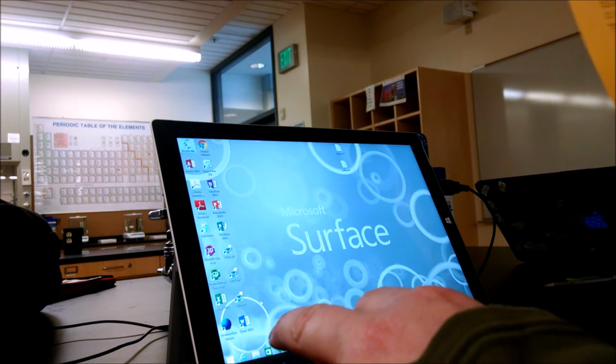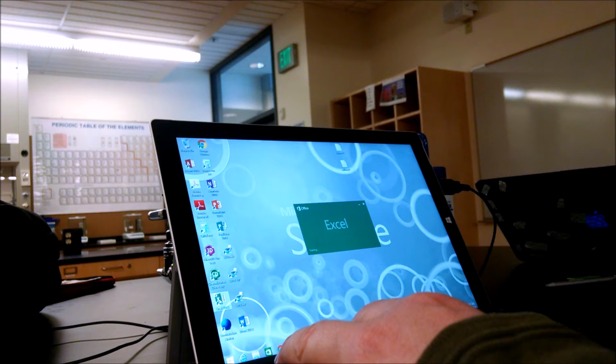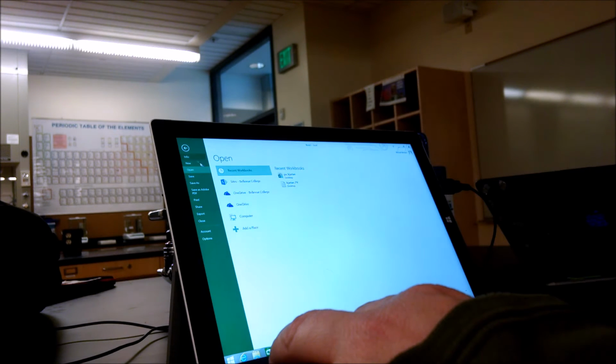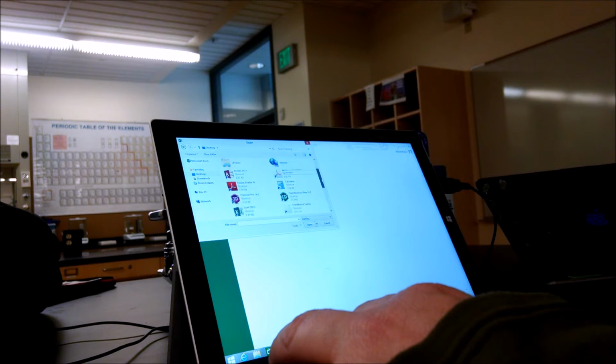We're good to go. Okay, so the directions say to open Excel. So I'm going to open Excel. And then it says, from within Excel, open your data file from part 1 of the lab. So that would be lab 1. So open number 6, Computer, Desktop, and then All Files, because Excel's arrogant, right? So then, where is it? PV. We're pretending to be Carton. Okay, open.